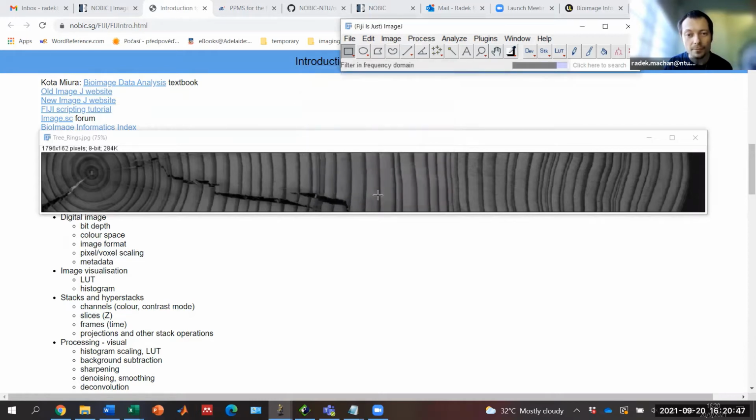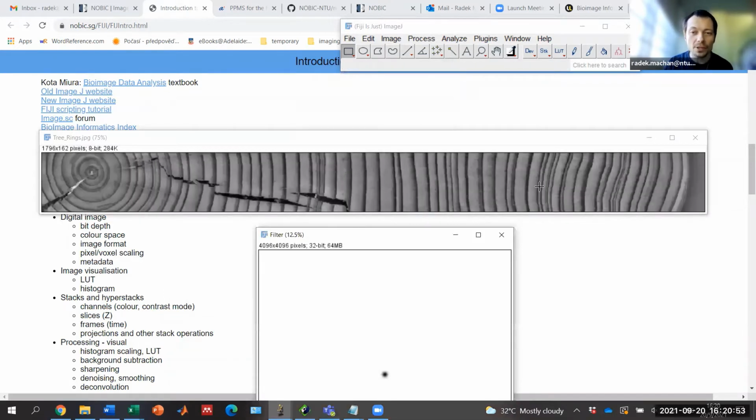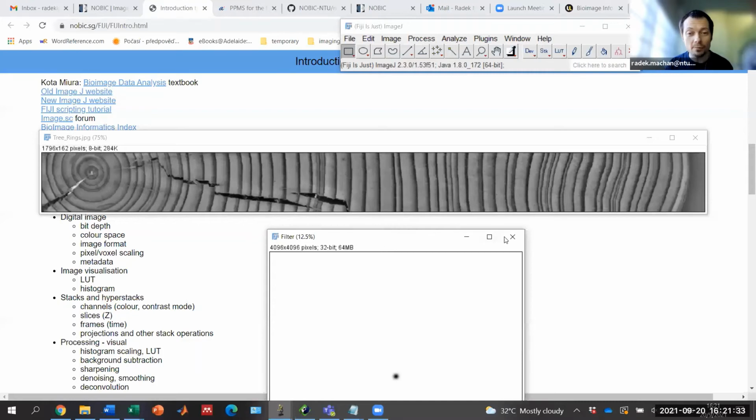Okay. This is the filter in this case, and you see that I'm basically flattening the background, because the background is something which is stretched over larger distances, so that means it has lower spatial frequencies. So I would say I like the spatial filtering a bit better for high frequency noise, but I find the frequency domain filtering quite nice for low frequency removal, that means for background removal.